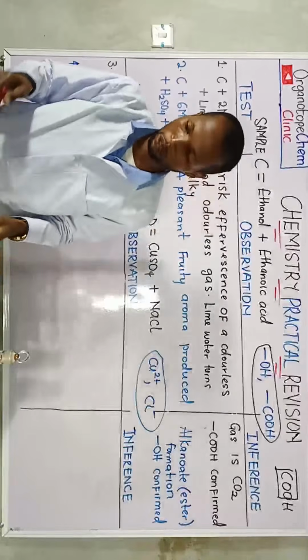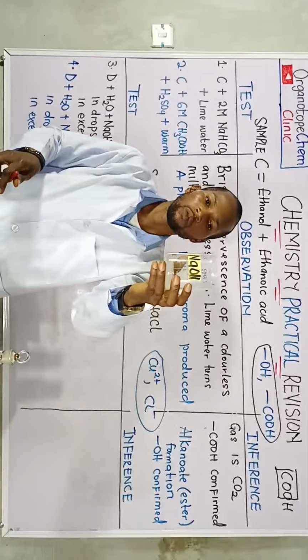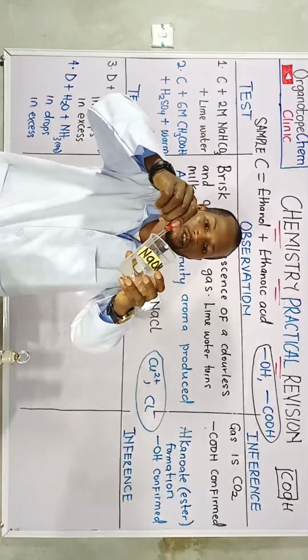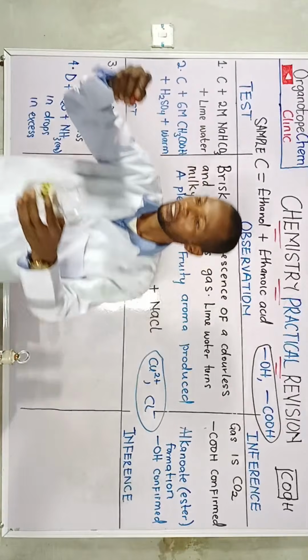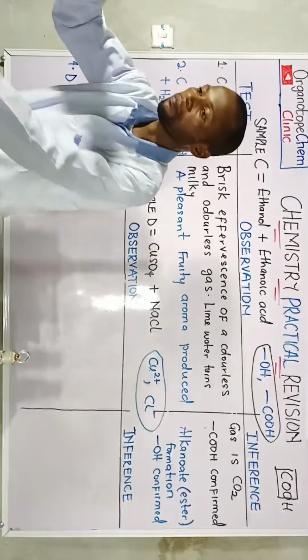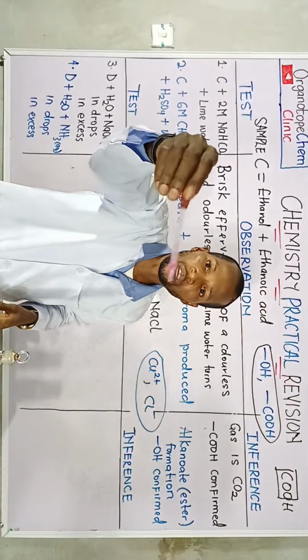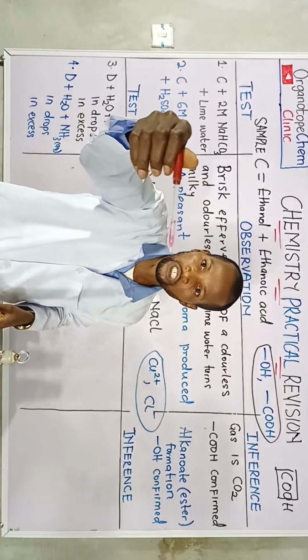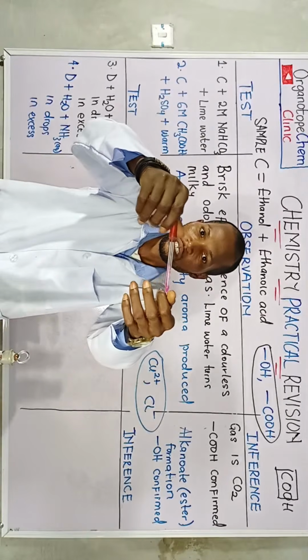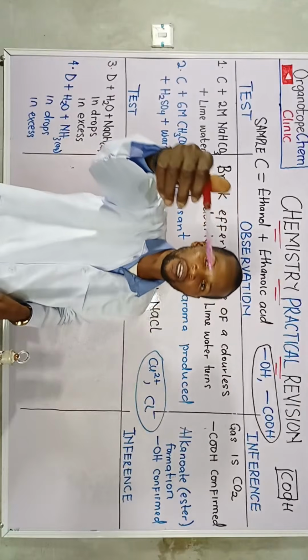dropper. So the first thing we are expected to do is to take the sodium hydroxide, right? We take the sodium hydroxide. Here is sodium hydroxide. I'm going to add in drop and then in excess. Wow. Now look at this. Right in the dropper, we are having a pink color already, which shows that the constituent of this dropper is what? Is it an acid or a base?